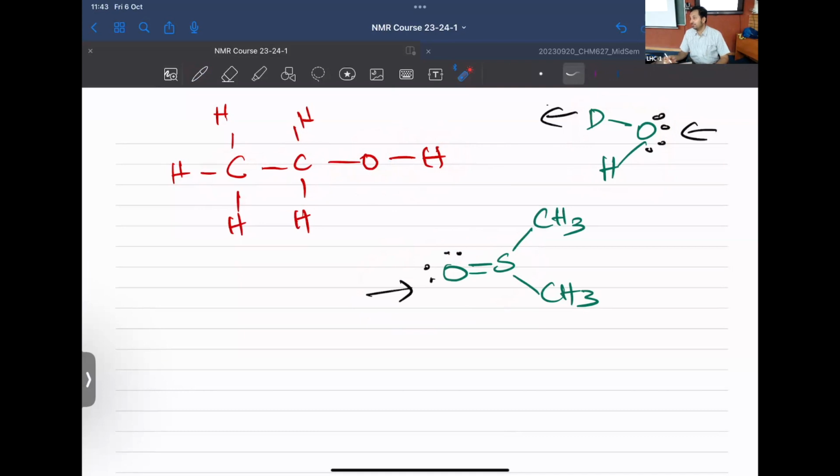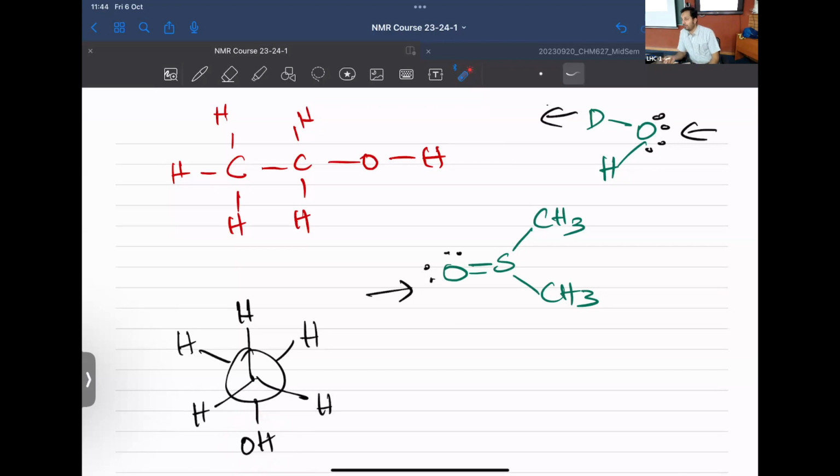So what you guys are able to see, NMR is so subtle that you just change the solvent, keep the same molecule, and there are some small changes that come up. NMR is a super sensitive technique this way. Chemical shifts get perturbed for a very, very small perturbation. We just changed the solvent. Ethanol didn't change. The bonds didn't change. Electronic cloud, if already it's electronegative, it will be taking the electrons from the methyl carbon. Now, if you're further taking it off, it's going to get further pushed. The small change in the electron cloud is enough for the chemical shifts to pick it up.